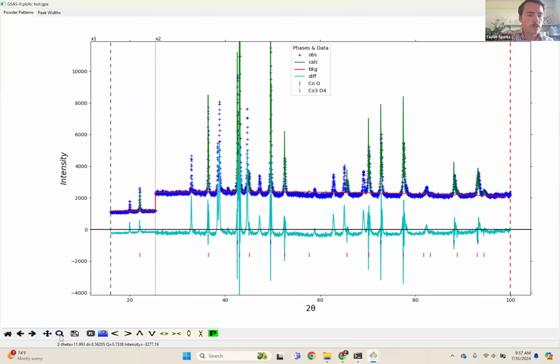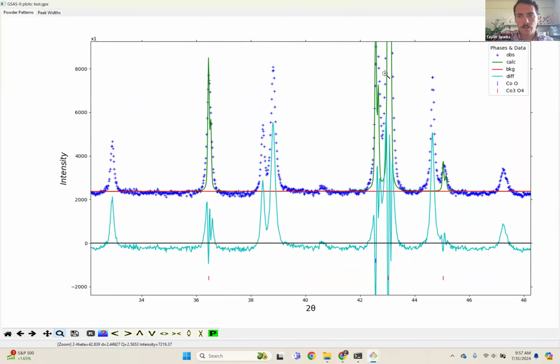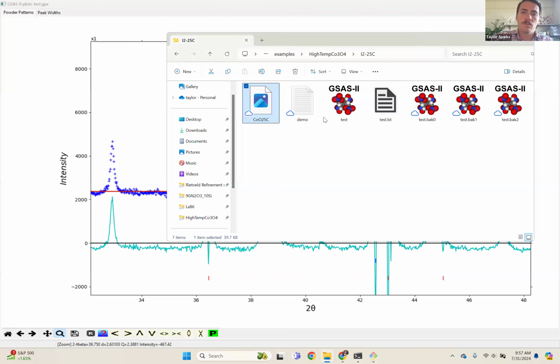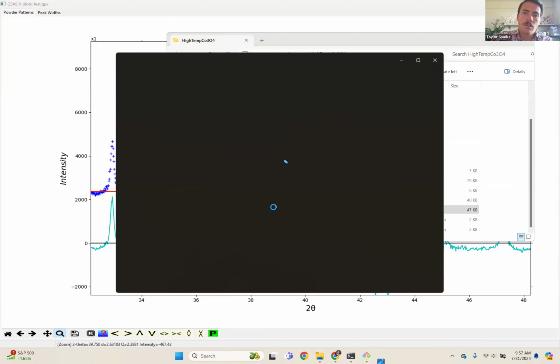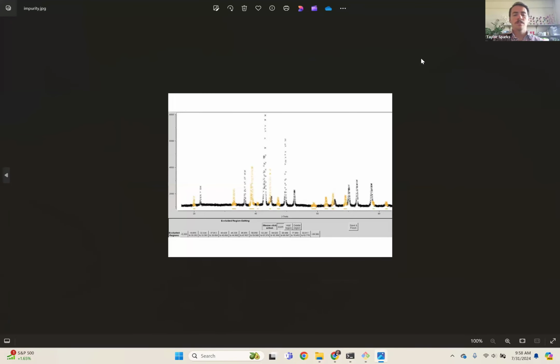But what I wanted to show you was the fact that there's multiple phases accounted for, right? So there are these big peaks, and that's this blue tick mark coming from the rock salt phase. There's this phase right here, which is kind of by rock salt, but this one is unaccounted for. There's no green line because there's no expected Bragg diffraction there. That's because I was using a sample holder right here, which was diffracting. Part of it was being captured by the beam of the radiation.